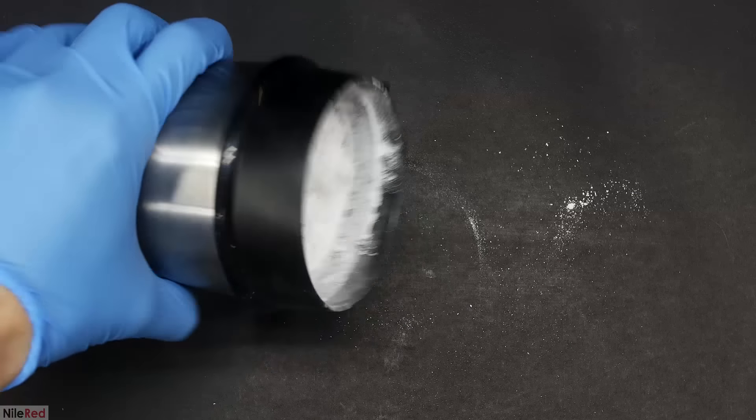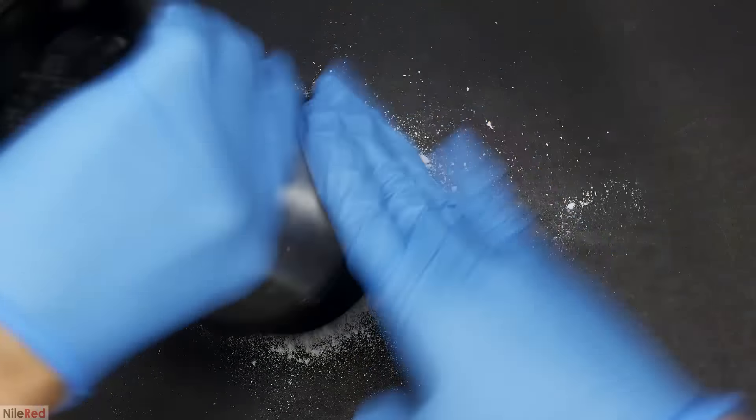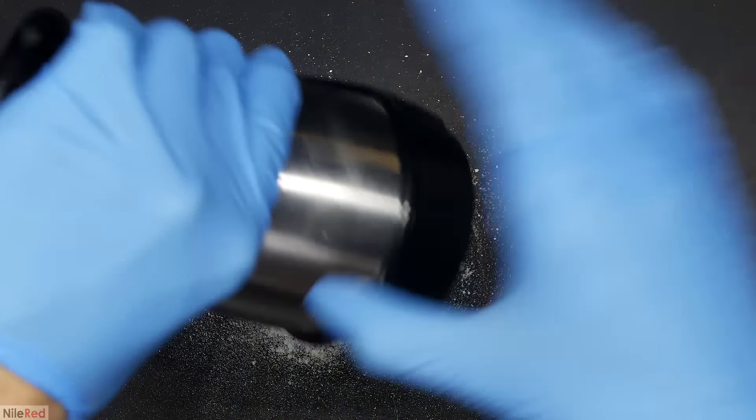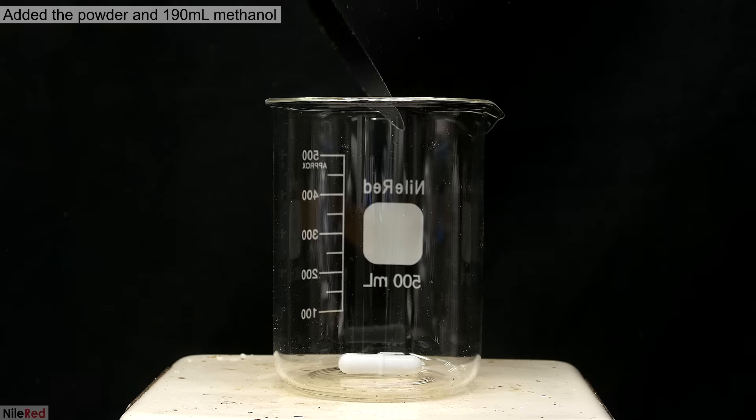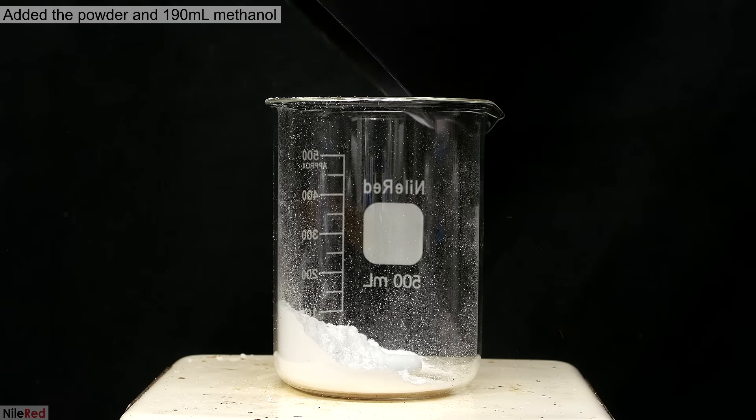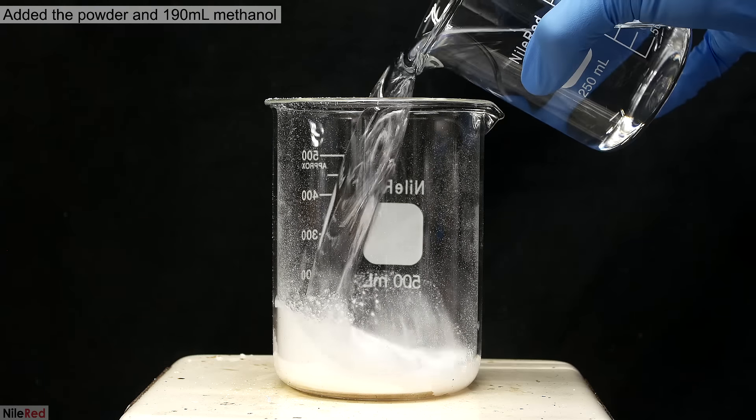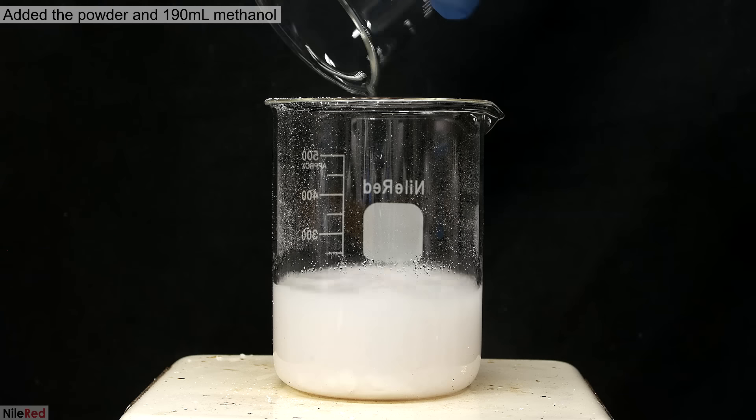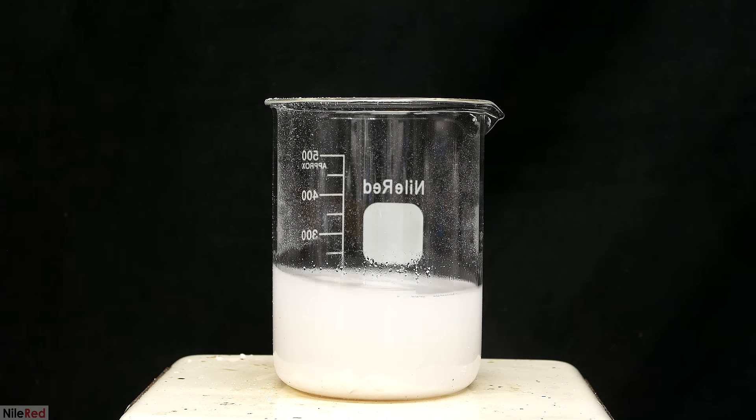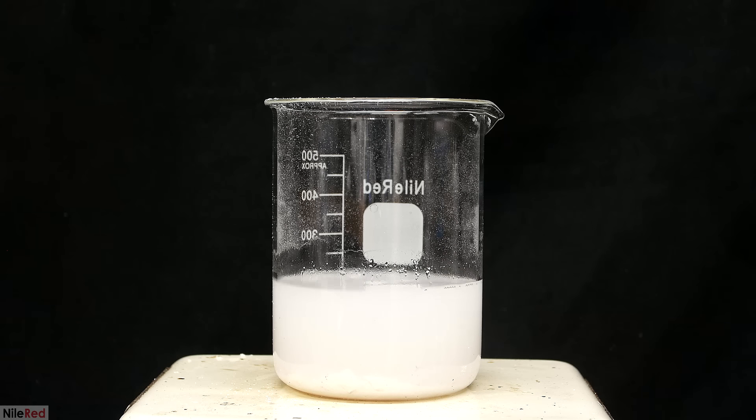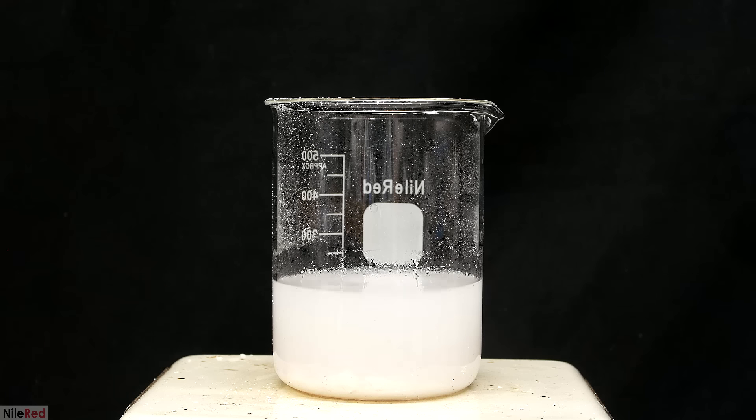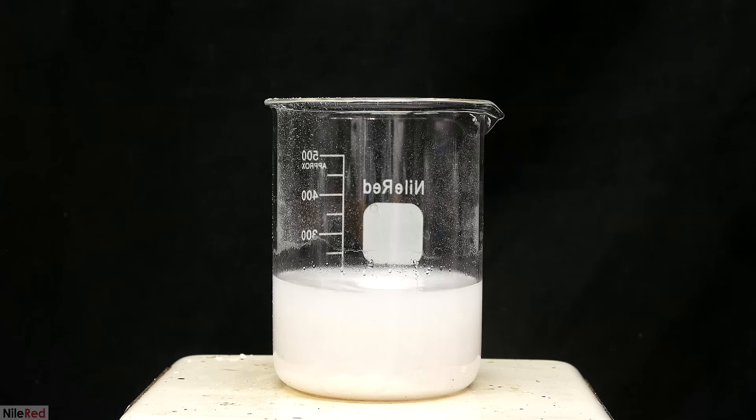I pour it out, and then I manually scrape off any powder that might be stuck inside, and add it to the pile. All of the powder is poured into a beaker, and on top of it, I dump in 190 milliliters of methanol. I turn on the stirring, and I let it mix for about an hour. What I'm trying to do here is dissolve all of the aspirin, and leave behind the binders, and the other junk that they include in the pills.